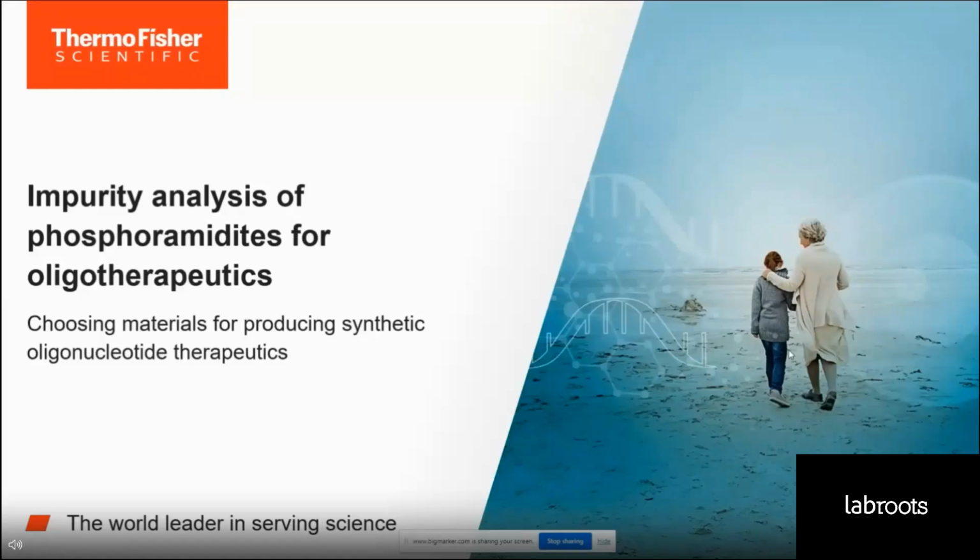I remember when I first started many years ago, the overall purity for phosphoramidite specifications was just HPLC and NMR. As we'll talk about today, there are many types of phosphoramidites used in therapeutics that weren't before, and the chemistry of them is more complex, and the technology to test them has become more mainstream and easier to use. Specifications have also evolved to ensure consistent product quality and a more complete understanding of impurities and their formation. So over time, the experience of a robust supply chain, supported by a consistent, scalable supply of product, will improve the overall product qualities.